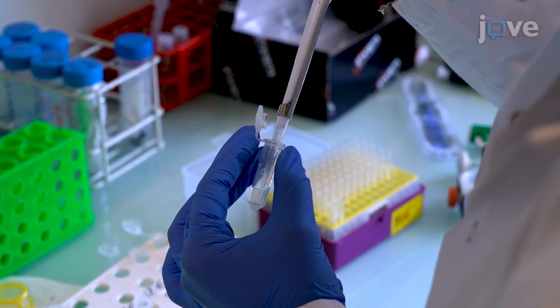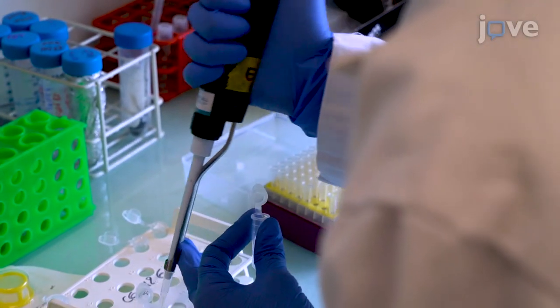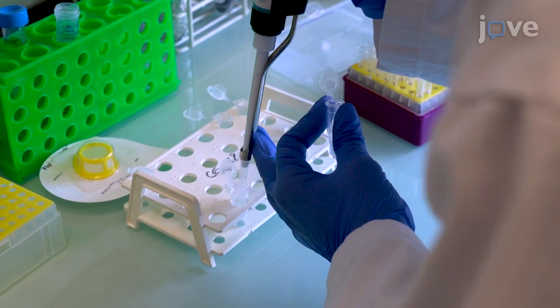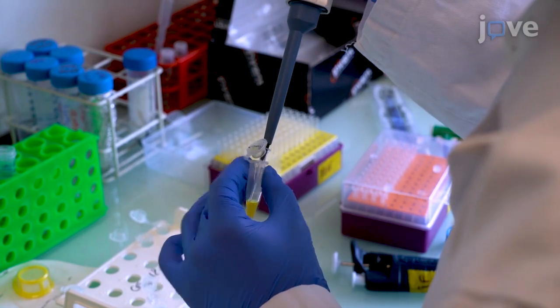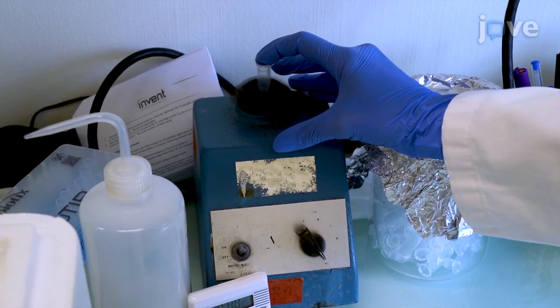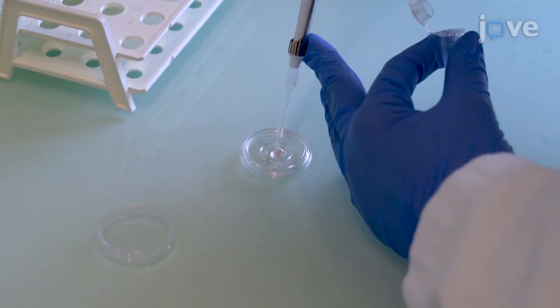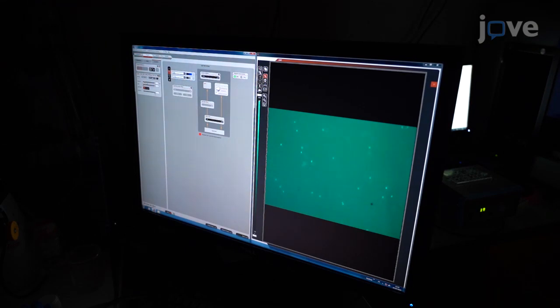To confirm nuclear morphology with HOECHST staining, transfer 100 microliters of the single nuclei suspension to a new tube using BSA-coated tips. Stain the nuclei by adding 0.1 microliters of HOECHST and gently vortexing the tube. Transfer the nuclei suspension to a glass bottom dish and image using a fluorescence microscope with a laser excitation setting of 405 nanometers.